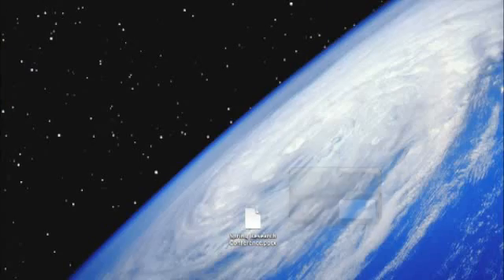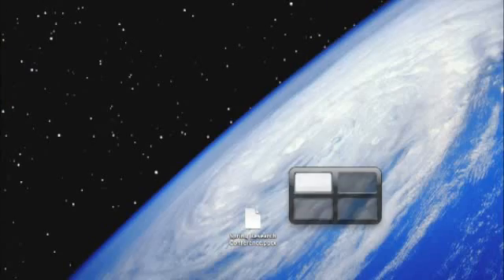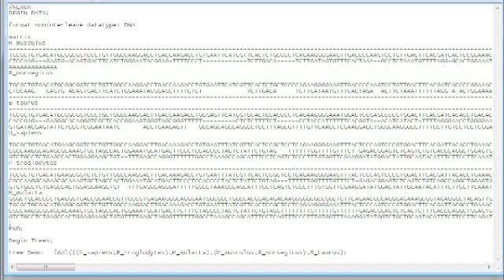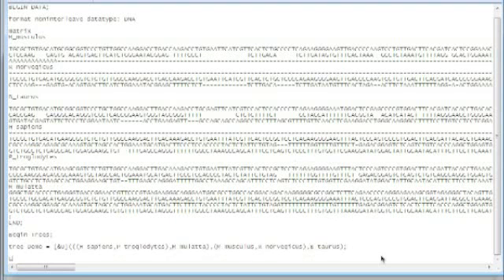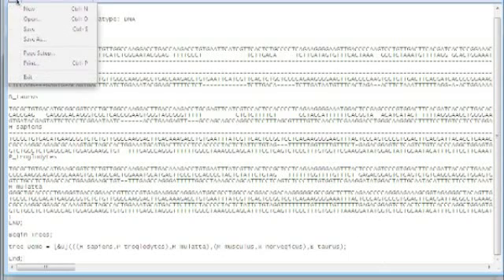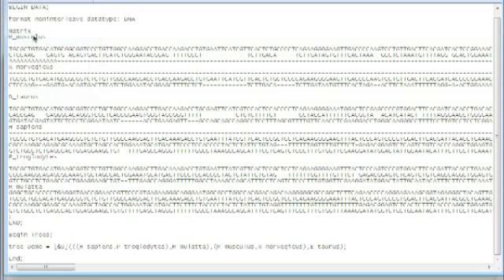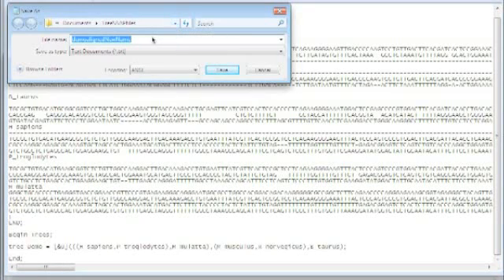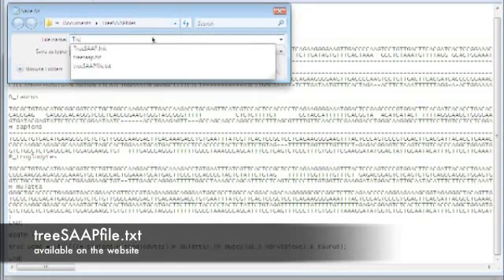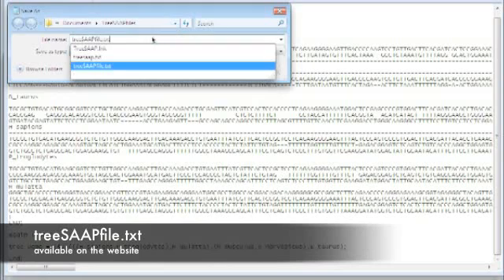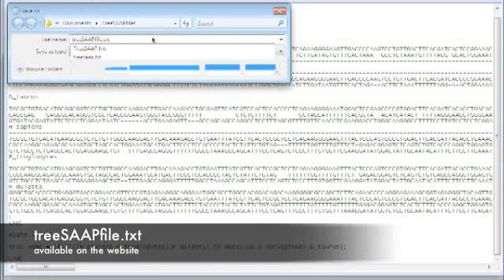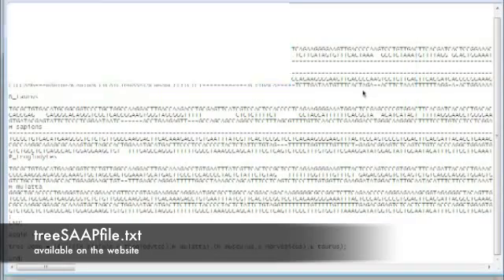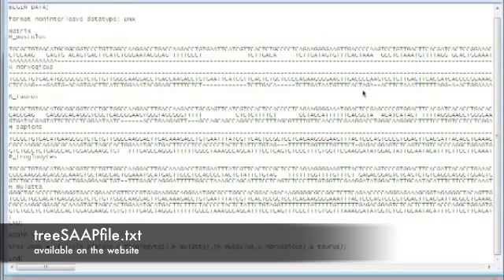Oh boy. Trying to go too fast there. You just do an end. And that is going to be our TreeSAP input file. I'm just going to save this out right now. You should save it out too as something, somewhere you're going to find it. I'm just going to save it as a TreeSAP file. And you can just save it as a text.